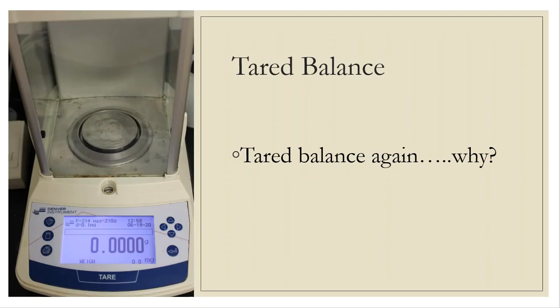All right. I'm then going to go to the balance. The directions are going to tell me that this clathrate with the methylene chloride is going to go into a beaker. I'm going to have to evaporate that off so I can be left with just the alkane only. So that also means that I need a massed beaker if that's where my product is going to end up being. So that's what this process is going to be.